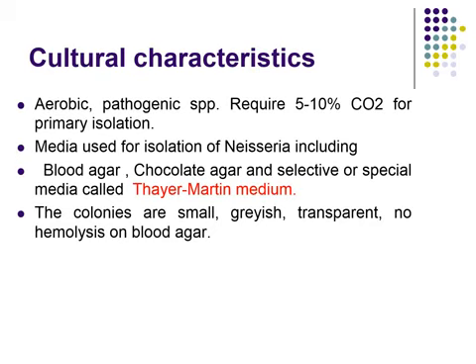Then use direct gram stain, and to confirm the result, the culture method must be used. This bacteria is aerobic and requires 5 to 10% CO2 for primary isolation.